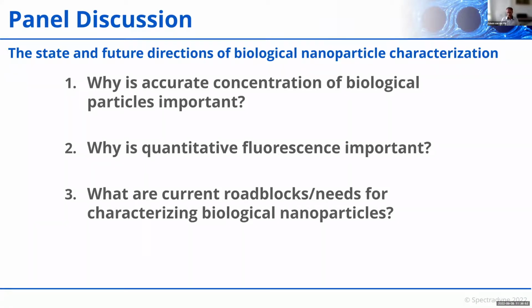And I think one major hurdle for the future there is to gain sufficient statistical information, because in some body fluids, the number of particles is rapidly increasing with decreasing diameter below 100 nanometers. So such single particle detection methods need to be very fast in the future, or be combined with an isolation method. And then the question is, what is the best interplay between that isolation method, which still might have to be developed, and this technology?